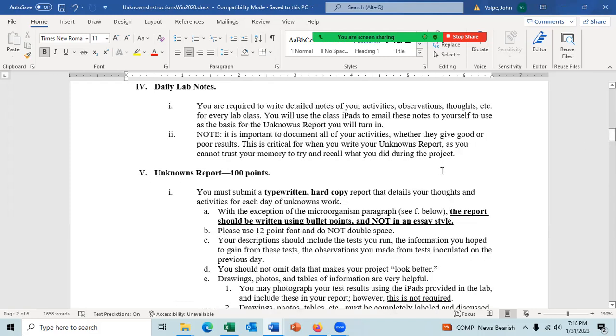When you write up your report, you should write up the daily lab notes. So each day you have in your unknown notes a page where you have something on the page. It may be results, it may be a test request, or it could be all of that. Okay.